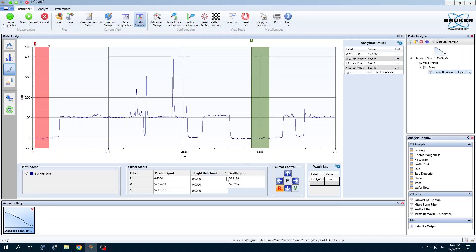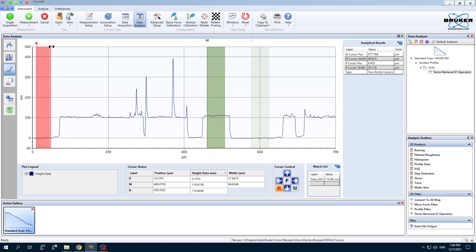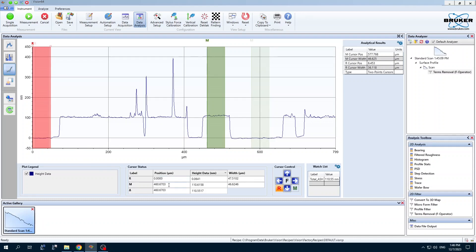Now I could take some measurements. For example, I could highlight an area here, highlight an area of the R. Now at the bottom of the screen, we have an average height over this width for the M cursor, an average height over the R cursor, and our difference of 110 nanometers.